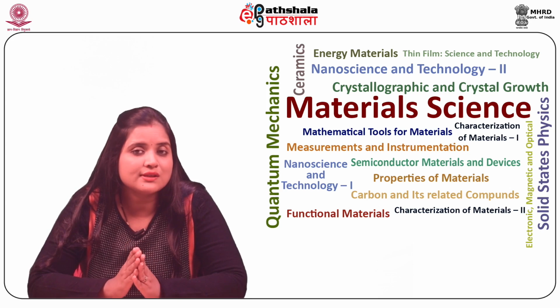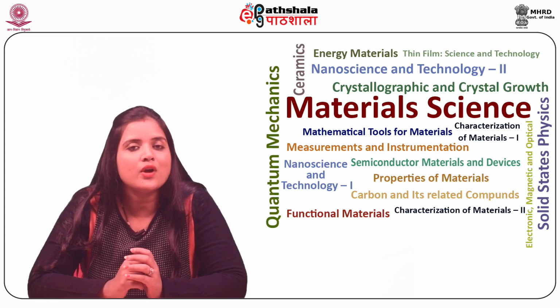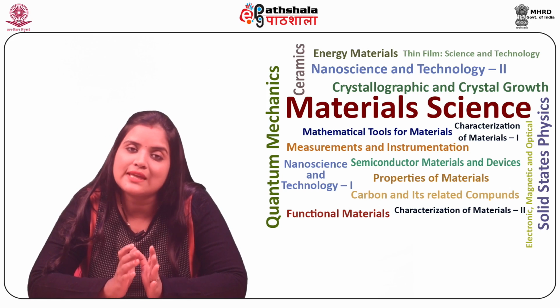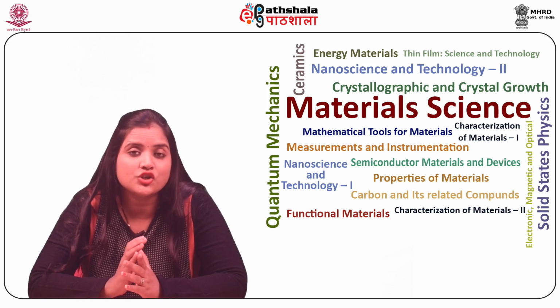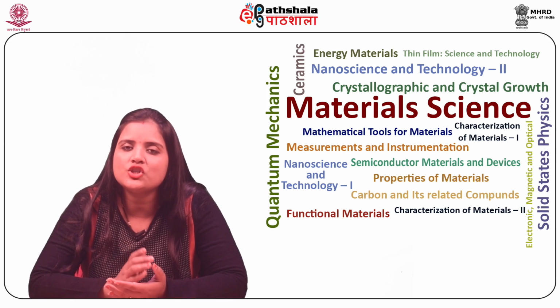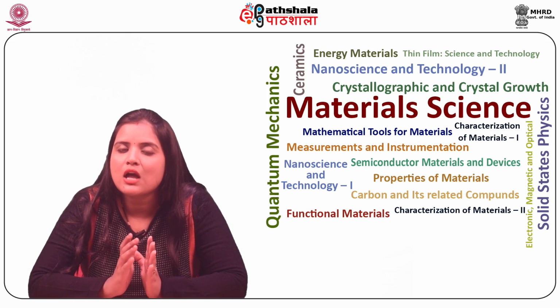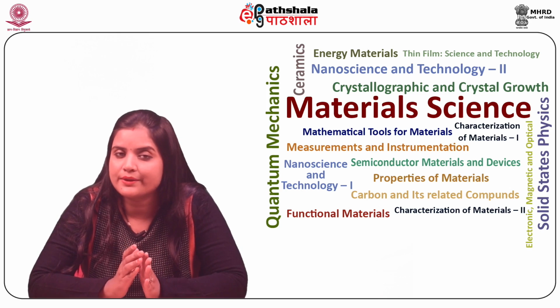Let us now discuss the applications of DHM. First one is living cells imaging. Owing to the non-invasive nature of DHM, it is particularly efficient in visualizing and quantifying biological tissues and the like.